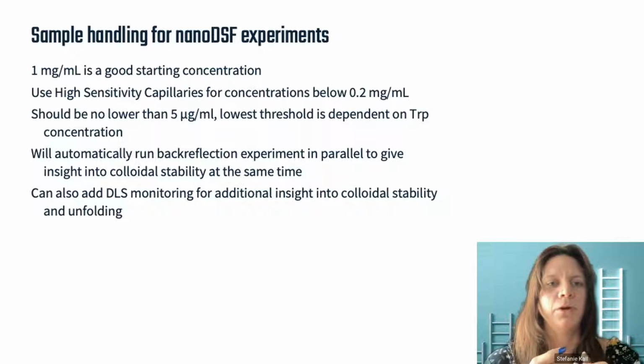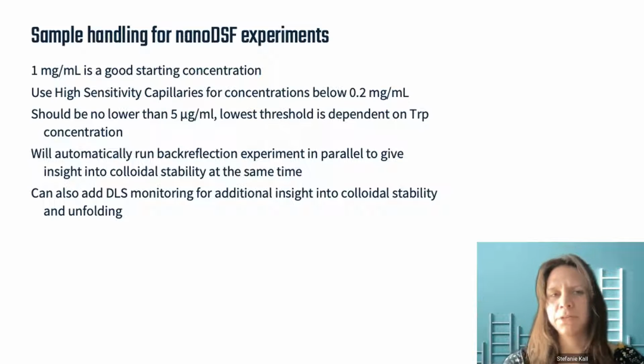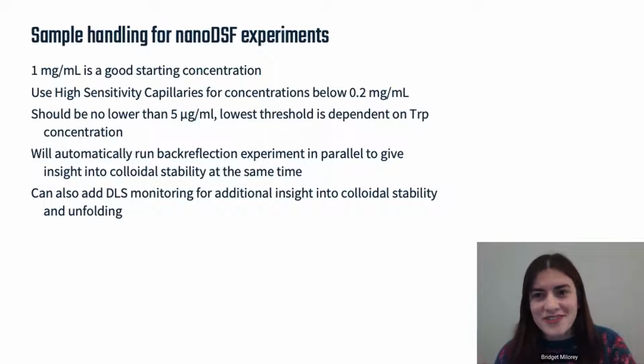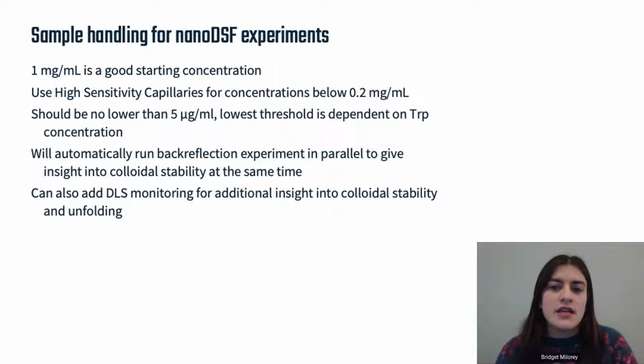Yeah, that's actually another really good point. A lot of researchers really want to know or see the aggregation in their samples. So can nanoDSF help with that work? nanoDSF alone won't tell you anything about aggregation. However, there are other ways to look for aggregation in parallel. For example, with the Prometheus Panta, we have back reflection optics and dynamic light scattering to help follow the colloidal stability over your temperature ramp.